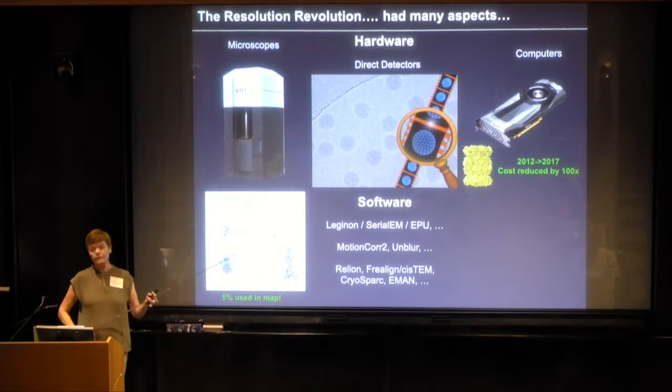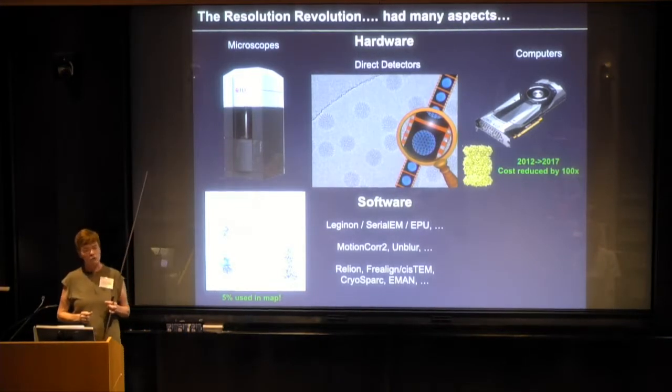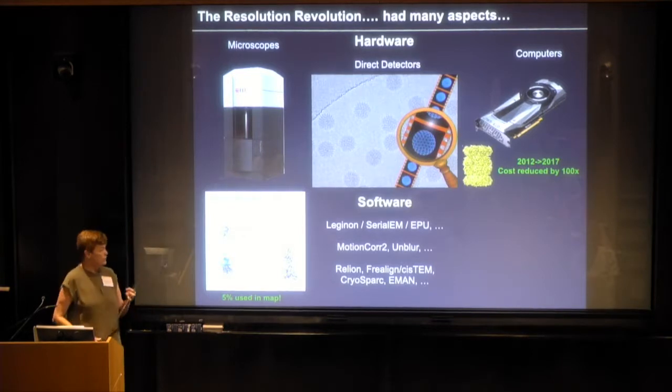And then the software to correct for that motion has gotten better and better and better. Every year it gets a little better, and we squeeze another half angstrom out of our structures. And I think there's still room to improve how to get that alignment on these very, very noisy images from image to image to correct for that.